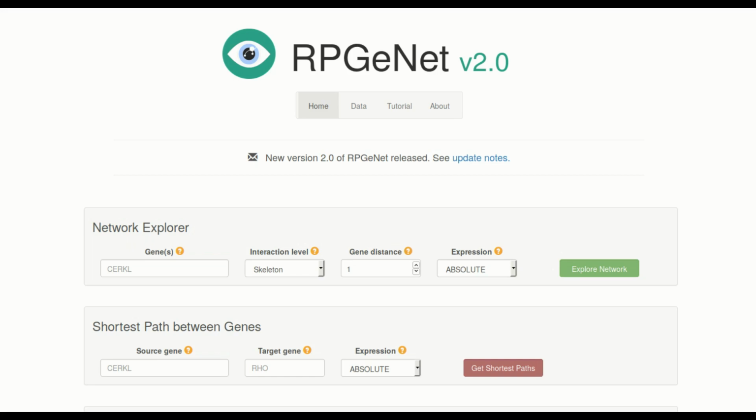This video is a guided tutorial that will help show you how to find your gene of interest in the network, learn how to edit, expand, or contract a graph in the Network Explorer, learn to set and change the expression visualized, learn to find the shortest path between two genes of interest, and finally learn to find all the pathways between your genes of interest to driver genes or to the skeleton.